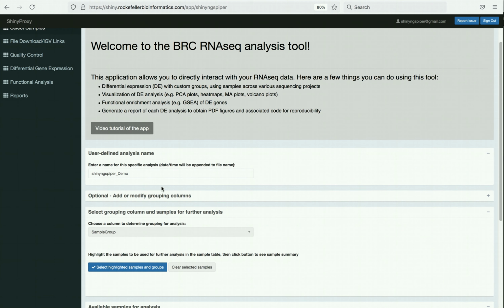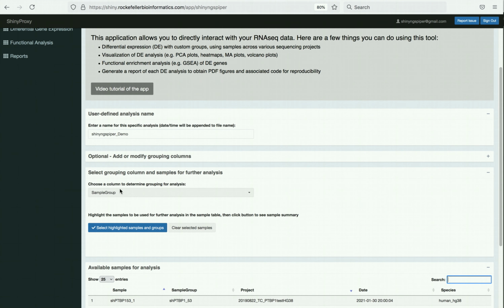And so just going through the boxes of this page, this first box is a project name, so every time you load new samples in the app, all of the reports and information and QC data that's tied to those samples will be listed in our database under a certain project name, and that's how you can retrieve them later on. So automatically, it's your name and your lab name, but you can change that for every project if you want.